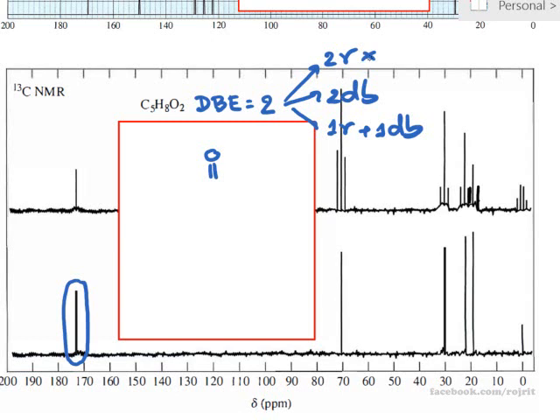To find out whether this molecule has a ring or is an unsaturated carbonyl, you have to look at the sp2 carbon connecting with hydrogen atom, or alkene. The alkene normally appears at about 5 to 6 ppm for proton NMR. So if you multiply it by 20, it ends with 100 to 120. That's the position of the alkene carbon. But as you can see over here, there is nothing at the position of alkene carbon. So it has to be the ring. So this is a cyclic carbonyl group.